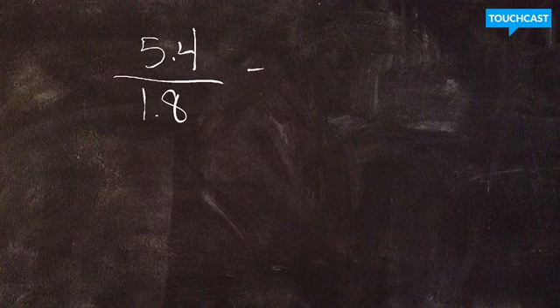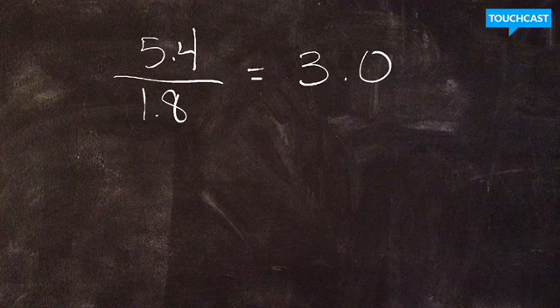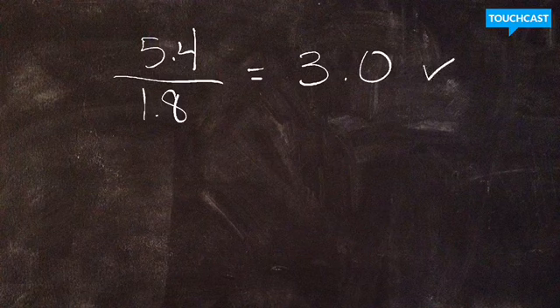The way they do this is they want you to put those retention values, do you guys remember those, into the form of a fraction. And you always put the larger value on top. We don't have any separation factors that are less than the value of 1, okay? So we're going to put that larger factor on top. Look back at part C. The blue dye had a factor of 5.4, and the red had a factor of 1.8. This gives you a selectivity separation factor of 3.0. That means you had a pretty good, effective separation.